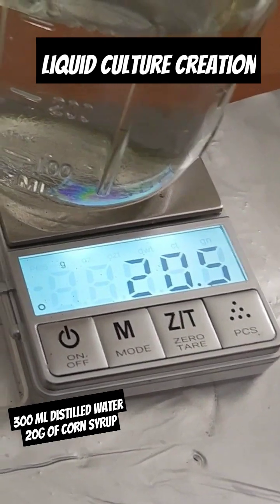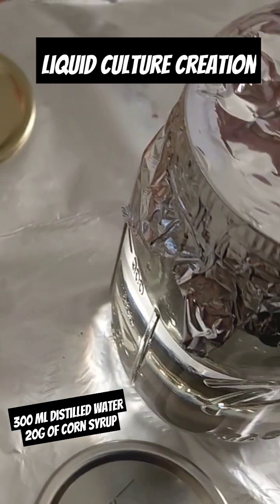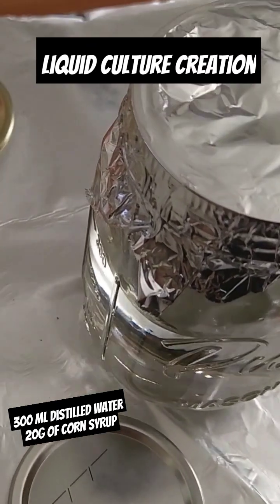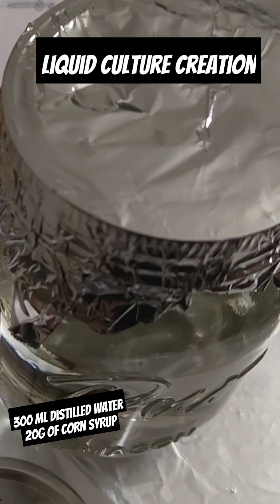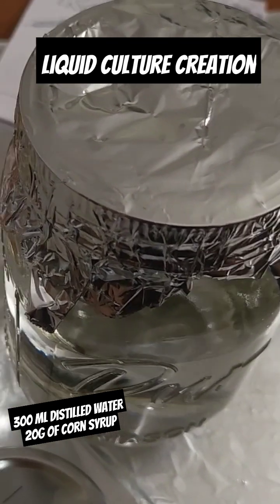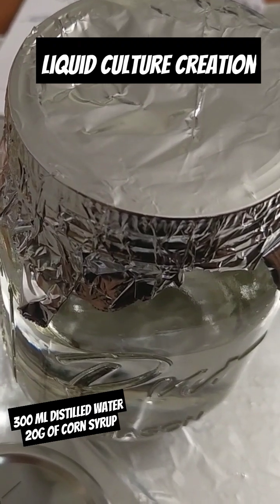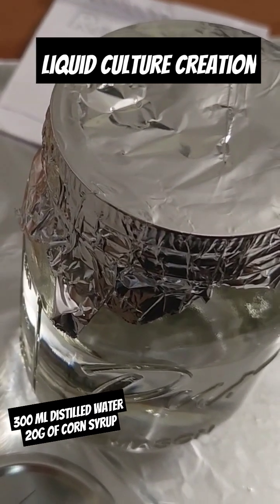I'm going to find an agitator. Cooking foil on top for 45 minutes in the instant pot — it's only 20-30 minutes if you have a pressure cooker that can maintain 15 psi. My instant pot is between 12-14 psi, so keep it in there a little bit longer.